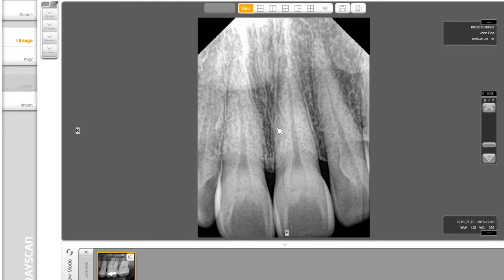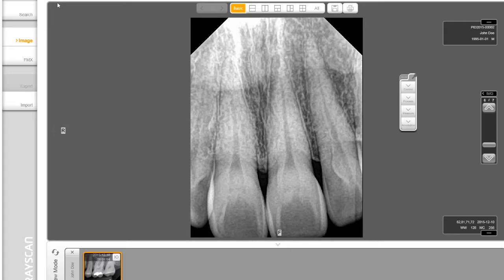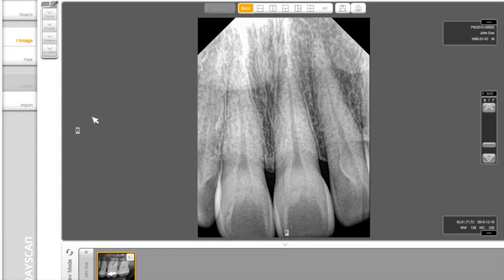Utilizing tools in RIOView. You have a series of tools on the left side. To expand or collapse any of the modules, simply click on their associated icons. If a toolbox is not in locked mode, it can be customized to display the desired toolbox option. In the top corner, you have tools in different sections. The first section is the Basic Control Manipulation tools.